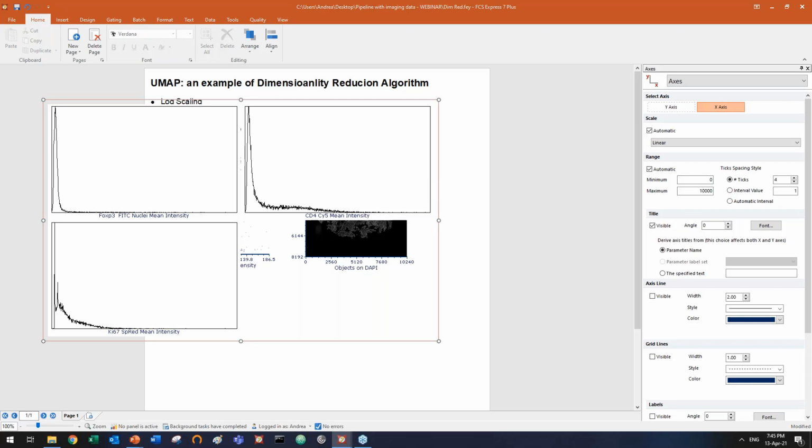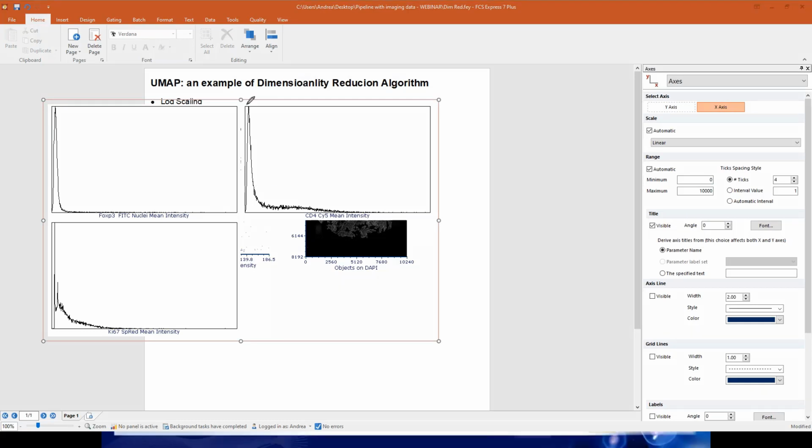And I can already tell you that this is not good. This is not good because look at this, for example. This is CD4, it's really easy to see. Those are the negative and those are the positive. These peaks are not really comparable.